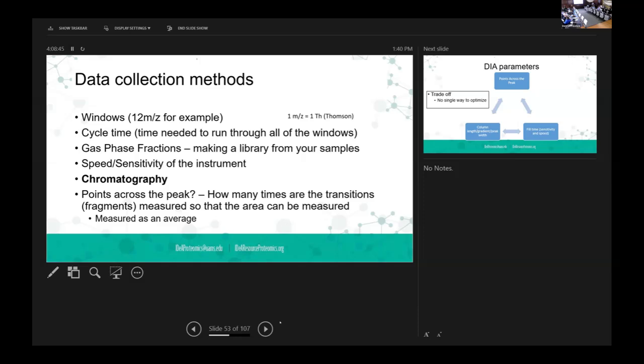We can dig a little deeper into the data, and I think it has to be this iterative process back and forth. You want to share things, but then you want them to come back to you and say, yeah, this is interesting, and then we can dig deeper. Because as the data grows, it's bad enough as it is right now. You're going to buy a new instrument, and now you're going to run 60 samples a day. We're barely surviving off 10 samples a day with manually looking at the data. So as that grows, there has to be some sort of tiered system.